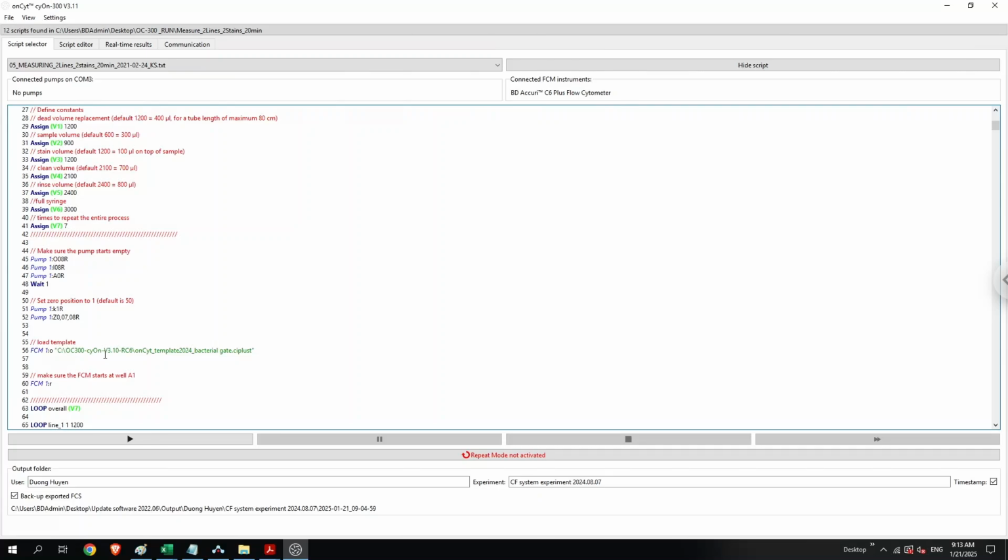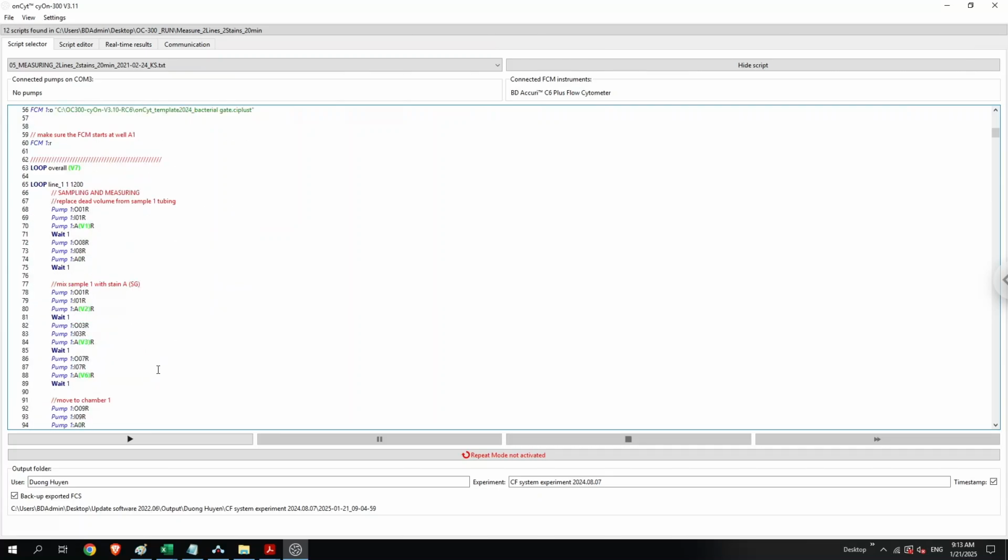So you can change this again. You can also click replace this. I will explain how to make the link like this later.